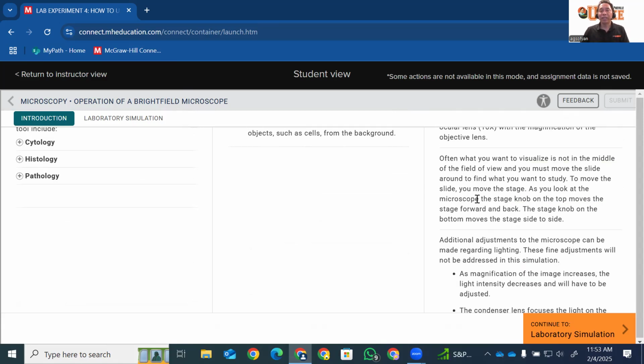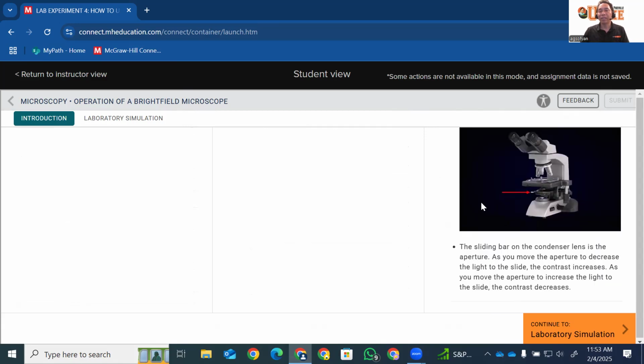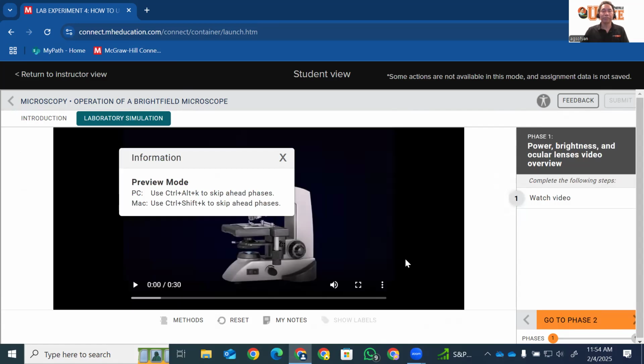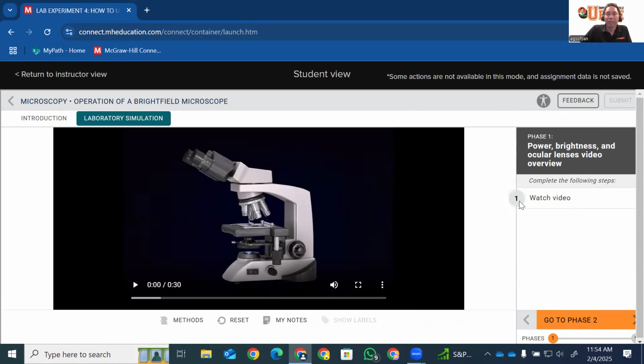If you have read this information on the first page, then you can go to the next. Just click next. It will tell you what to do. In this case, you will have to watch the video. It is an obligation for you to watch the video. You can click X here, and it says number 1, watch the video.